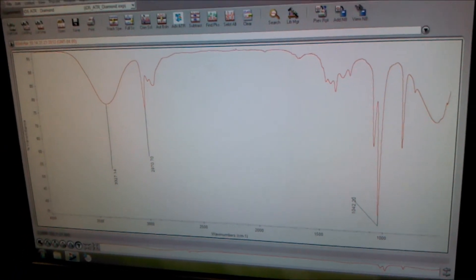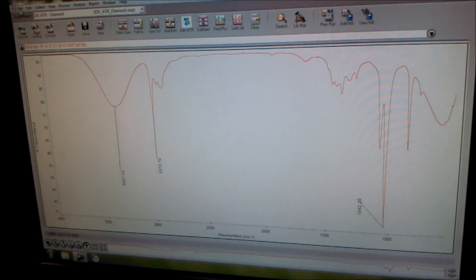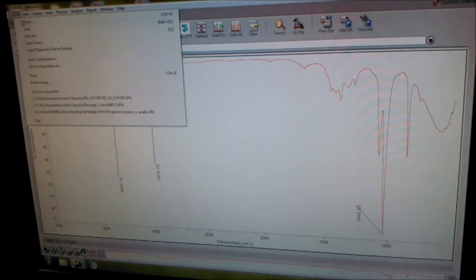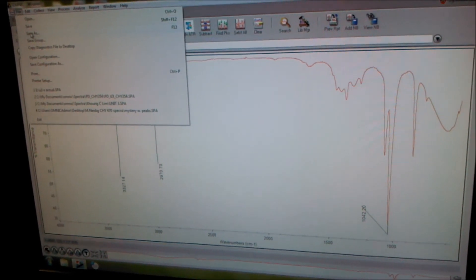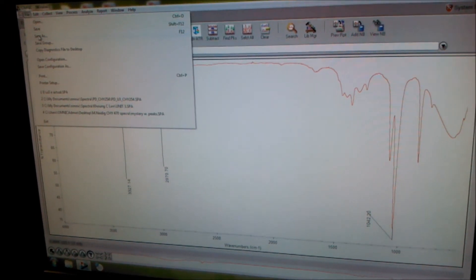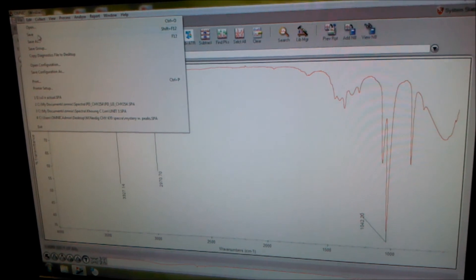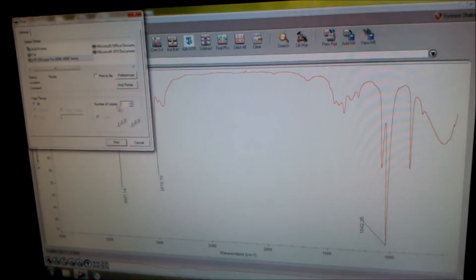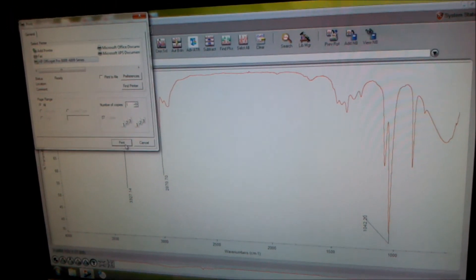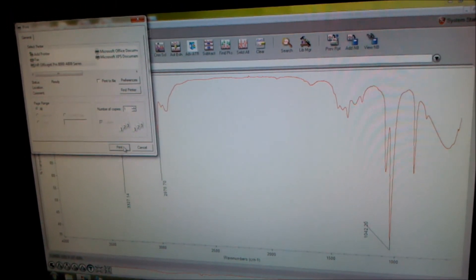And now what you want to do is you want to save it. File, save as. Make sure you save it on your jump drive. And then print a copy for your lab report.